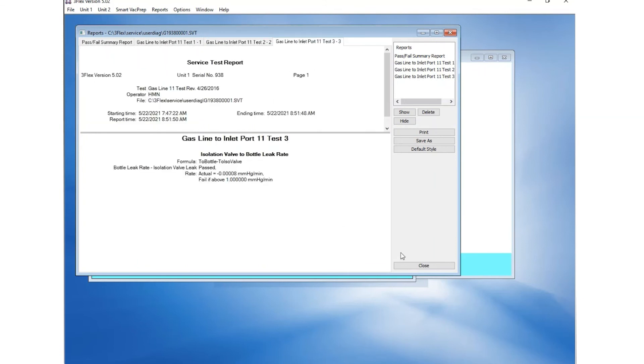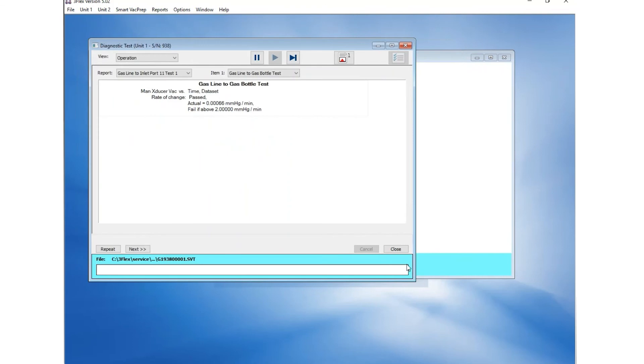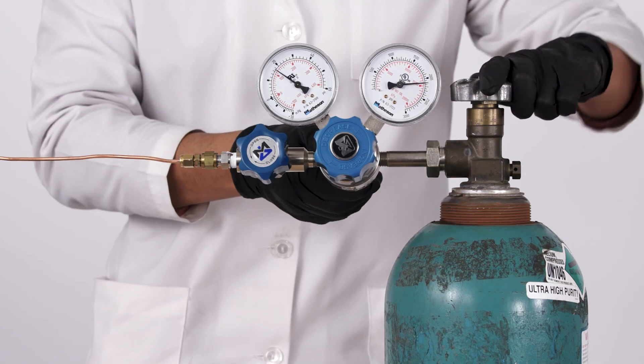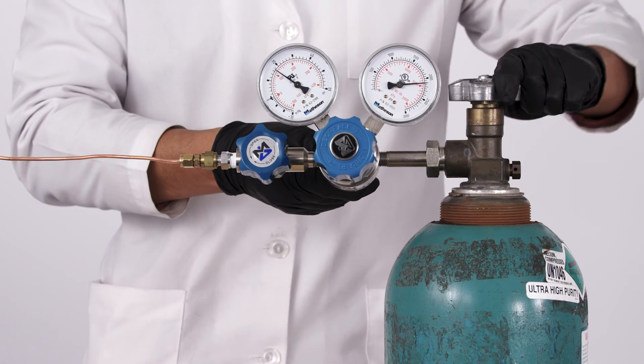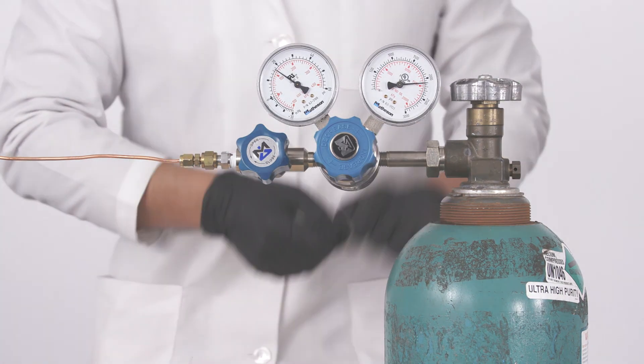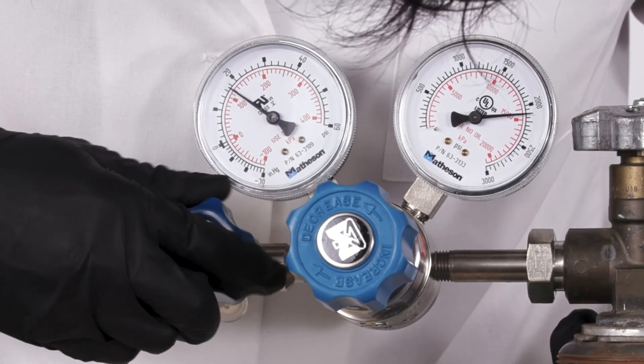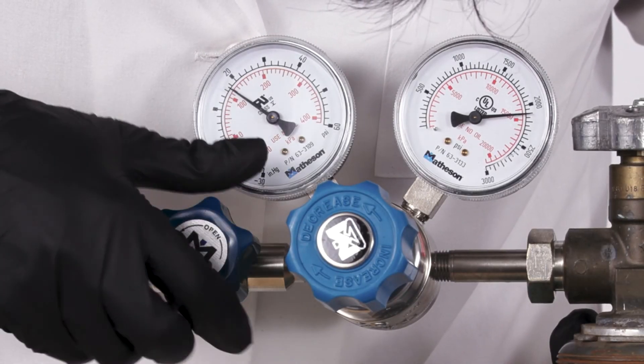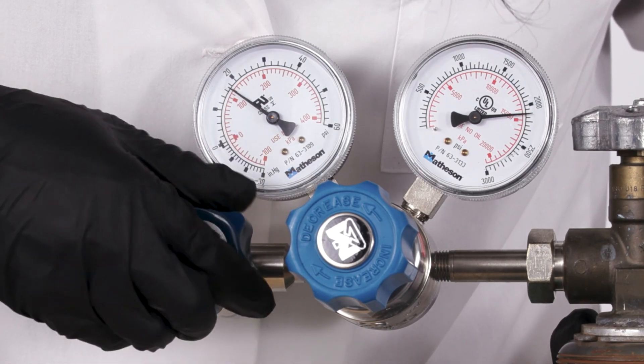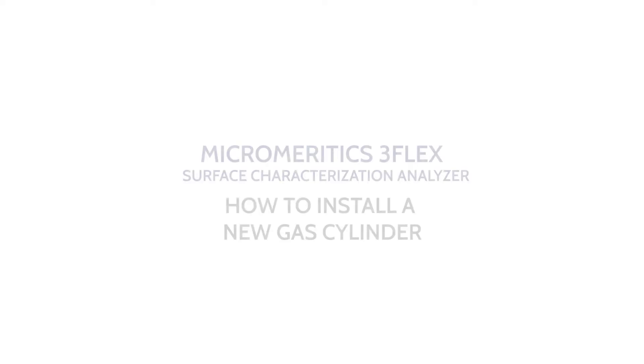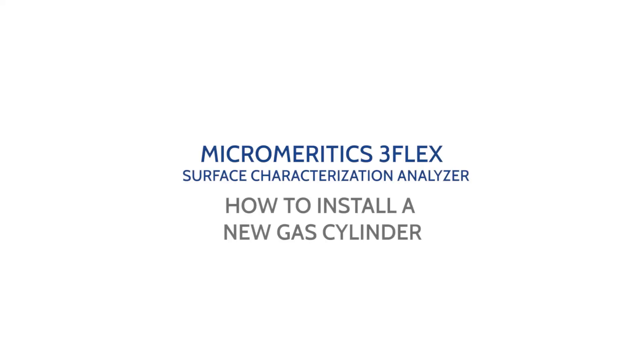If all three reports pass, open the main gas cylinder shutoff valve and verify that the regulator shutoff valves are also open. And that completes this demonstration on how to install a new gas cylinder on the Micromeritics 3-Flex Surface Characterization Analyzer.